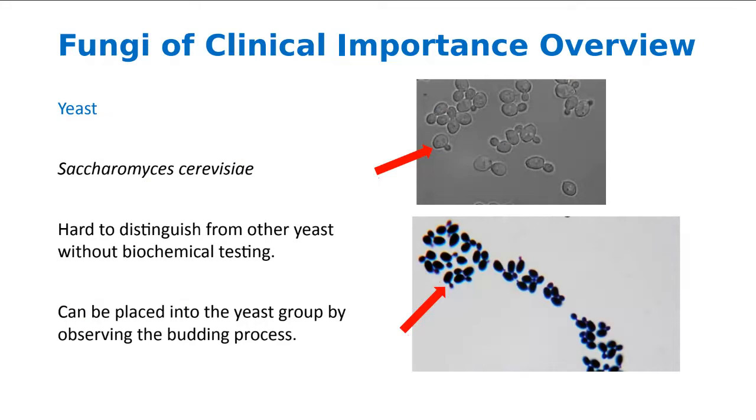So now, Ava, I'm going to put it all together, right? So this is yeast. How do you know it's yeast? Tell me. How do you know it's yeast? It's budding, right? So this is an unstained slide, right? Right here, unstained. And so you can see it's kind of hard to see. So we can stain the organisms and it makes it easier to see. The problem is once you stain something, you kill it. So these are alive, these are dead.